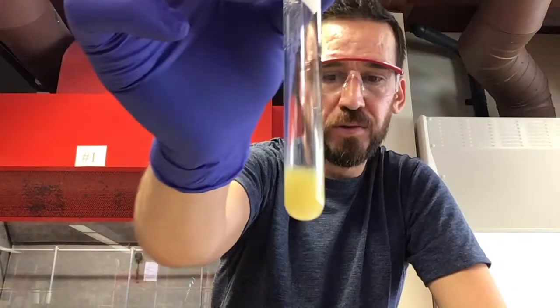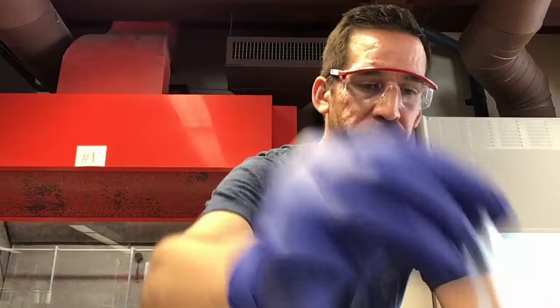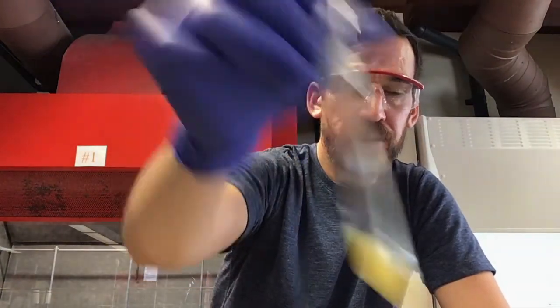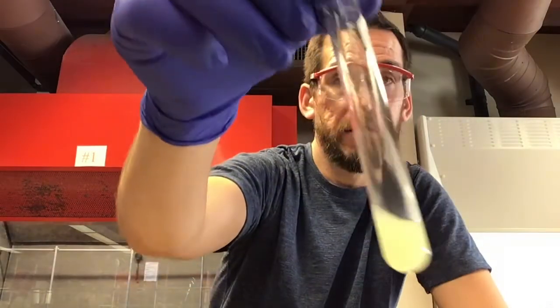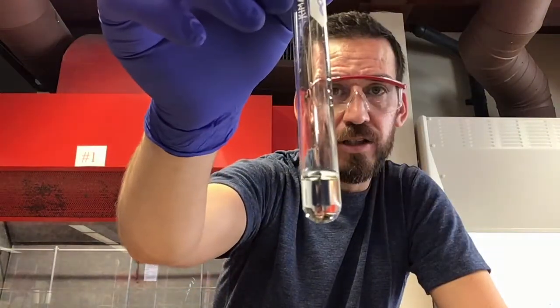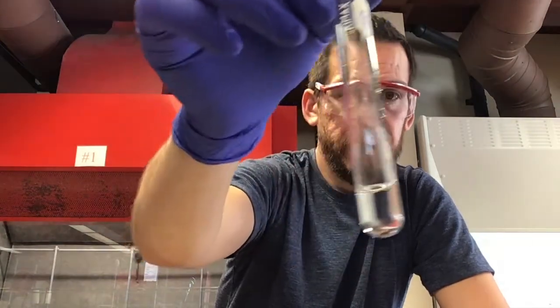Number 6, which is crotyl chloride. That looks kind of chunky. Not really chunky, but it looks like some thick juice, actually. Kind of delicious. Number 7, that's benzyl chloride. That looks like some thick juice. Here's number 8, that's bromobenzene.